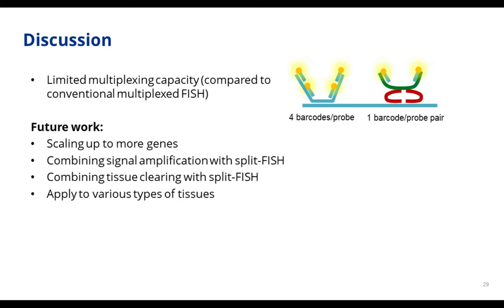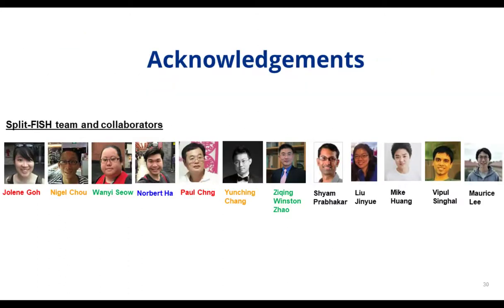And I think with split FISH, more work needs to go into it to allow it to scale up to more genes. And we are also working on trying to introduce signal amplification or tissue clearing to further improve the performance.